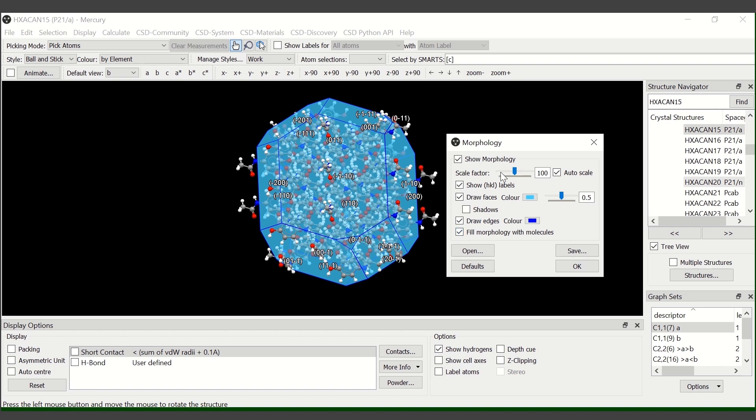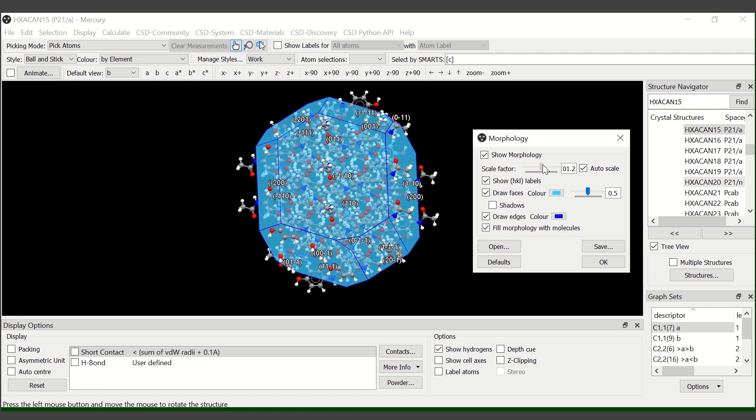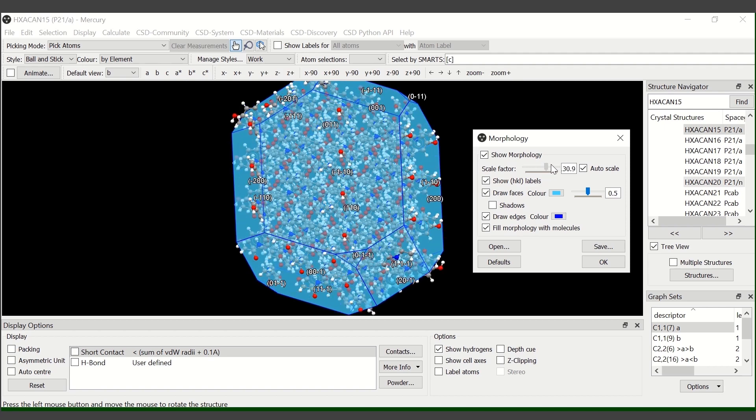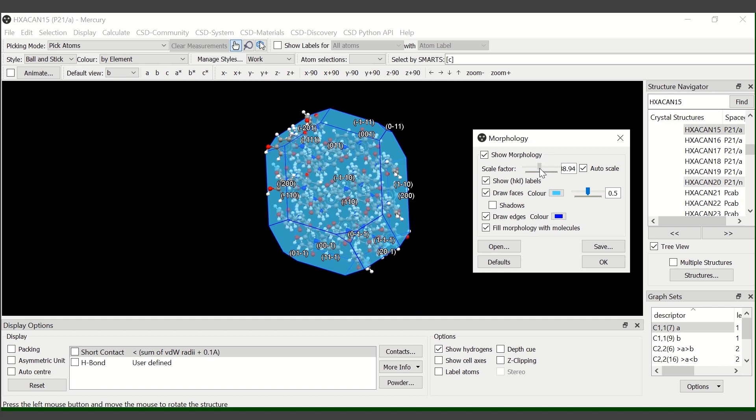If we use the scale factor slide, which is at the top of the morphology menu, we can enlarge or reduce the size of the crystal.